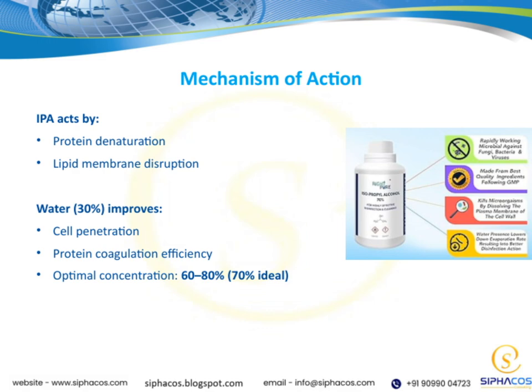Now, water plays a crucial role here. About 30% of the IPA solution is water, and this actually helps improve two key aspects. It enhances cell penetration, allowing the IPA to reach and affect microbes more effectively, and it boosts the efficiency of protein coagulation, making the disinfection process more effective overall.